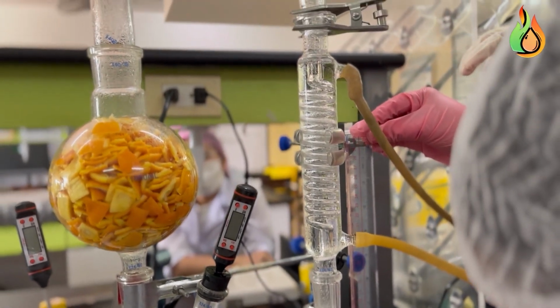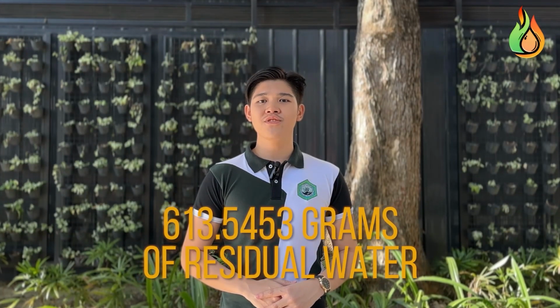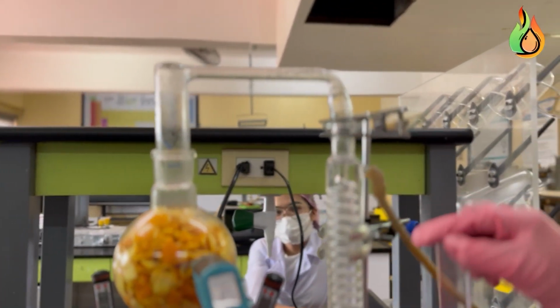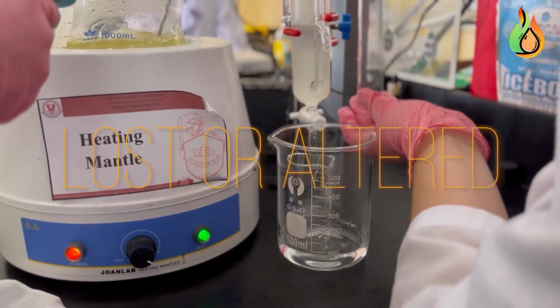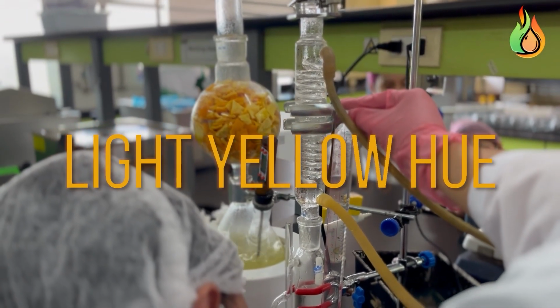The process resulted in the recovery of 587 grams of biomass and 614 grams of residual water, while 50 grams, around 3.31% of the initial mass, was lost as uncondensed vapor. The scent did not fully capture the optimal orange fragrance, as some volatile compounds may have been lost or altered during the extraction process. The oil is characterized by prominent terpenic notes and a light yellow hue.